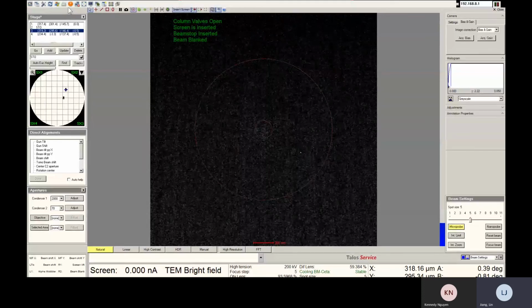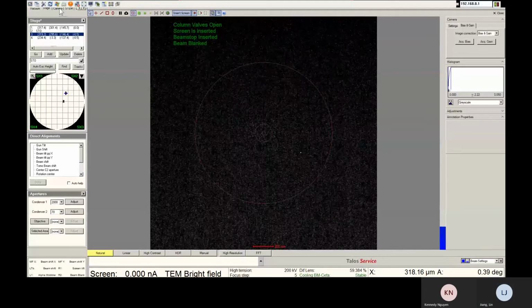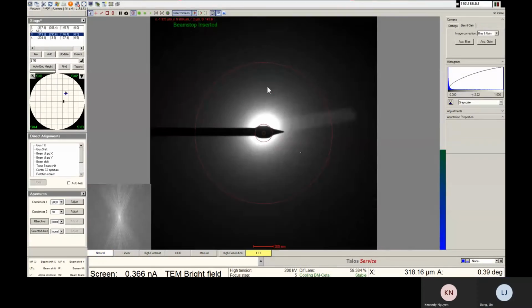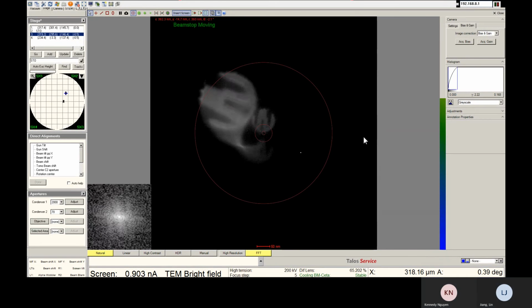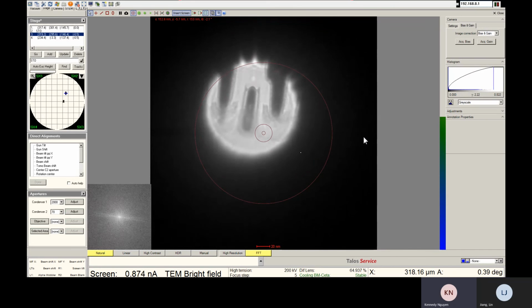Oh, I blanked the beam. Sorry. Okay, so it's not too bad.